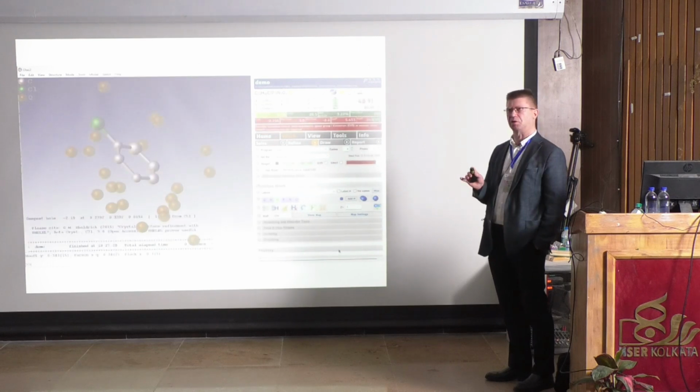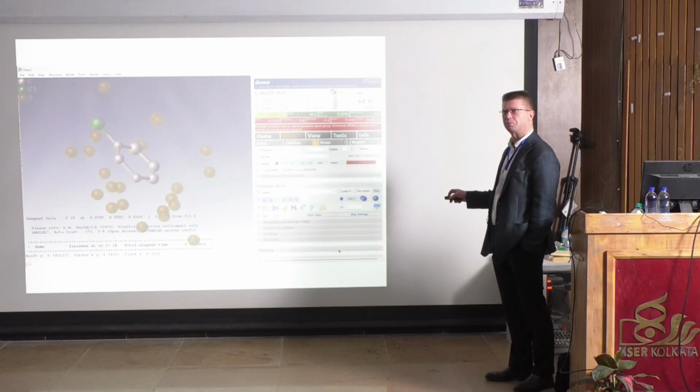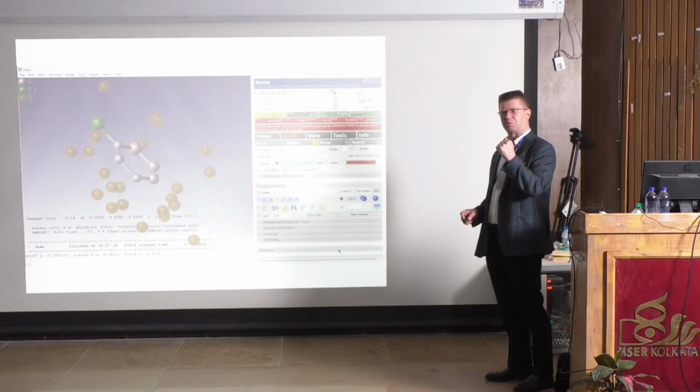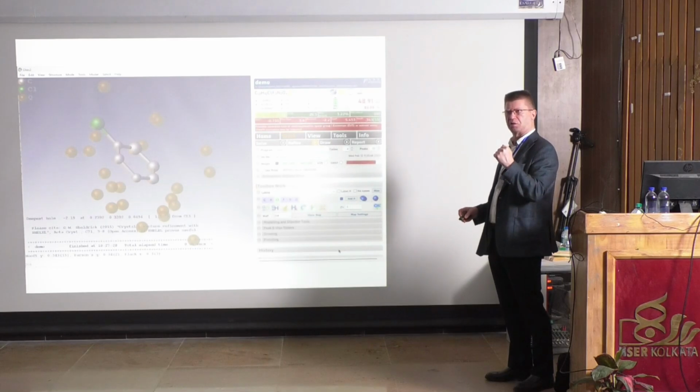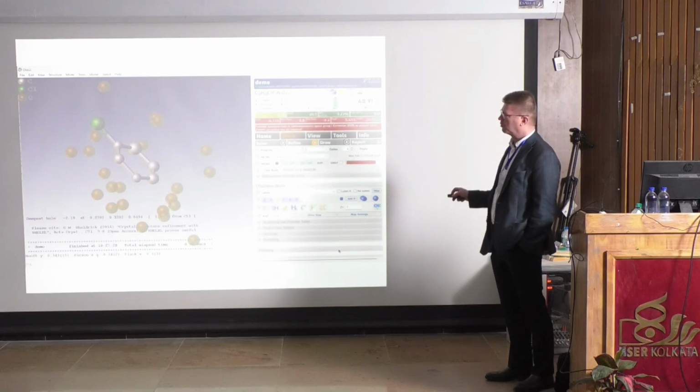Now something interesting happens. Look, there is again the blob of these brown balls, and now you can see that they changed the size of the balls. And now what is happening is it's estimating the thermal movement of the atoms, because all the atoms are vibrating, so it estimates their thermal movement as a sphere. You can see there are different sizes, don't worry about it.